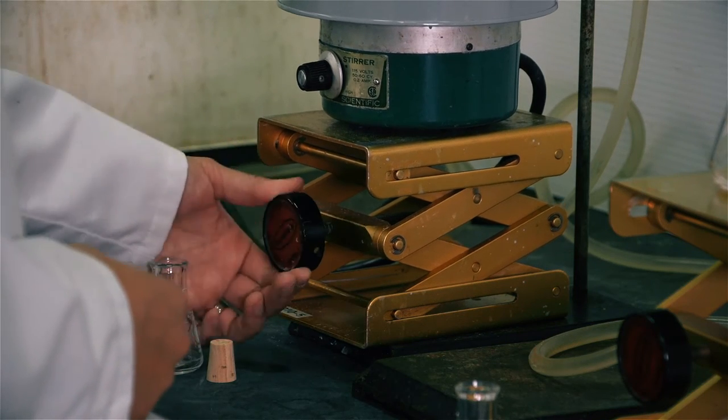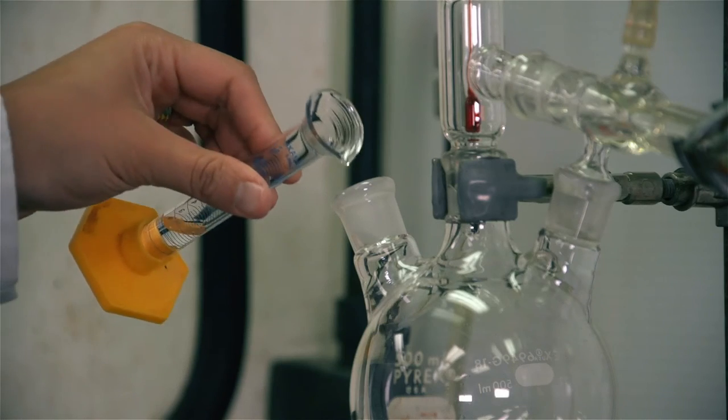Lower the heating mantle. Return the distillate to the boiling flask and add 3 ml of water.